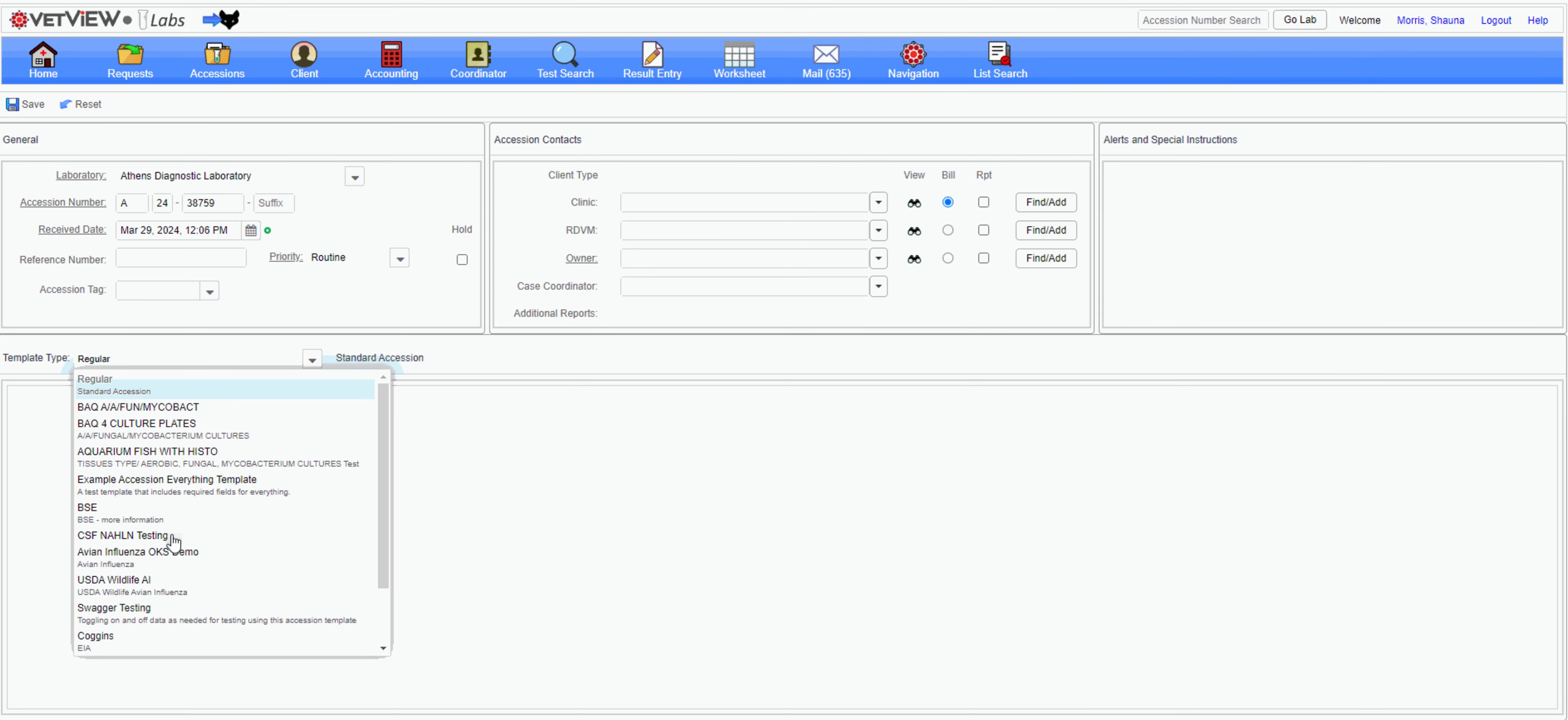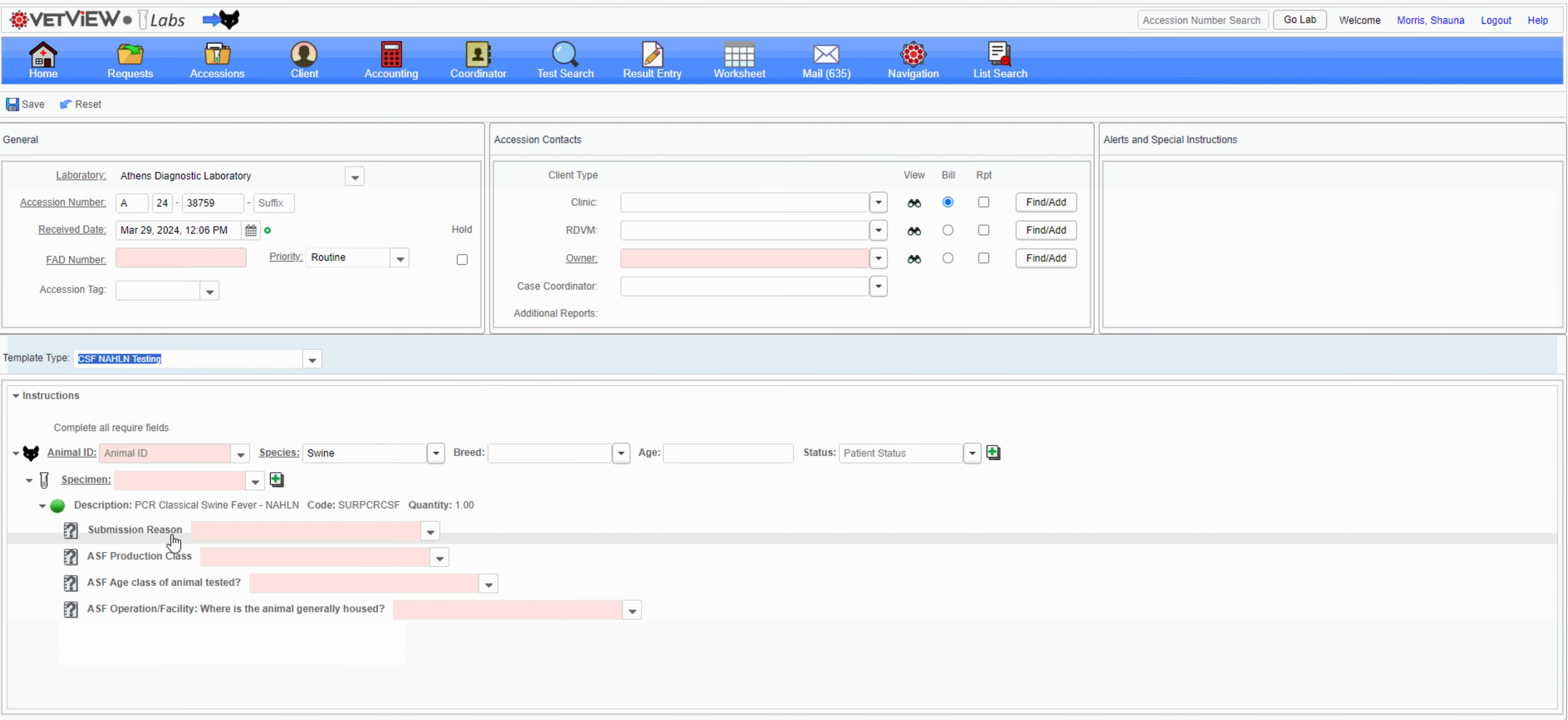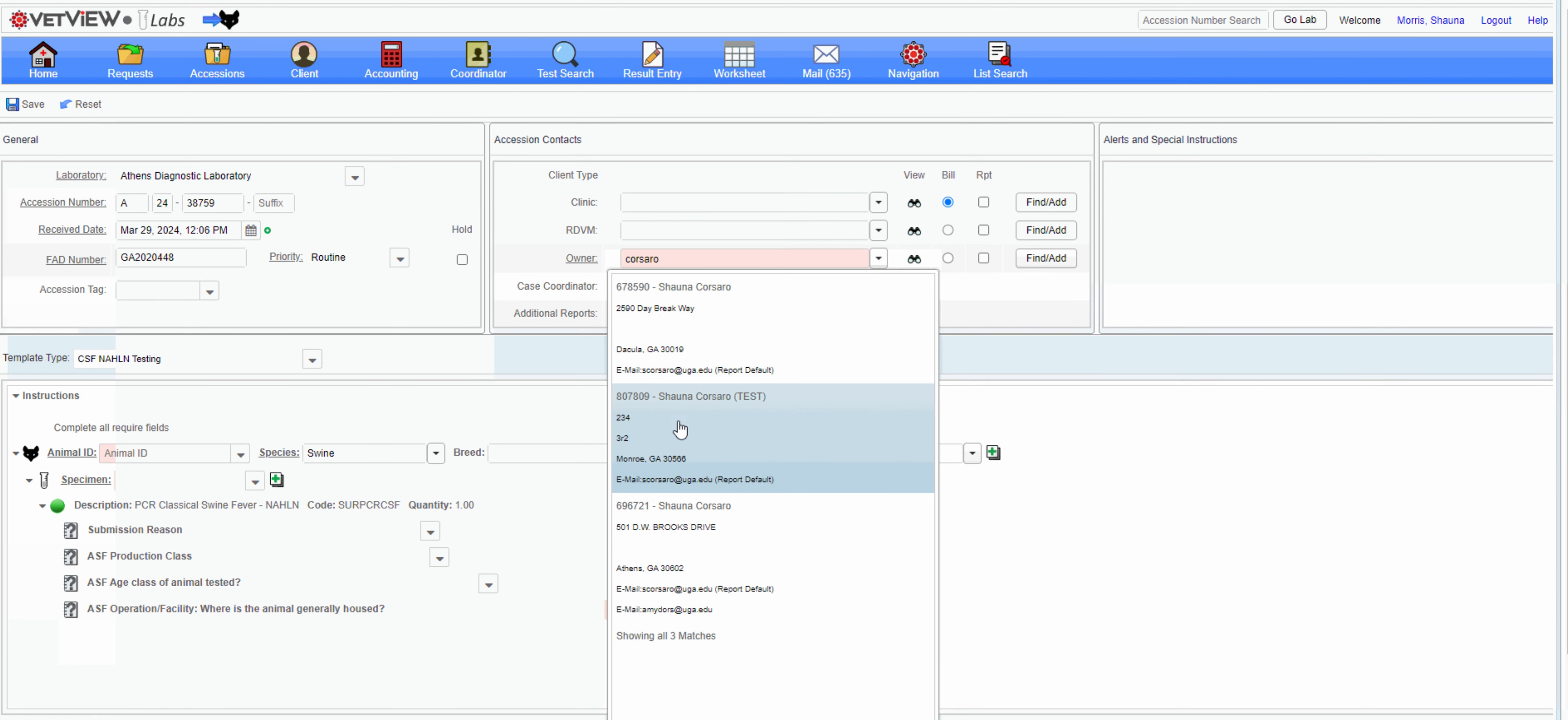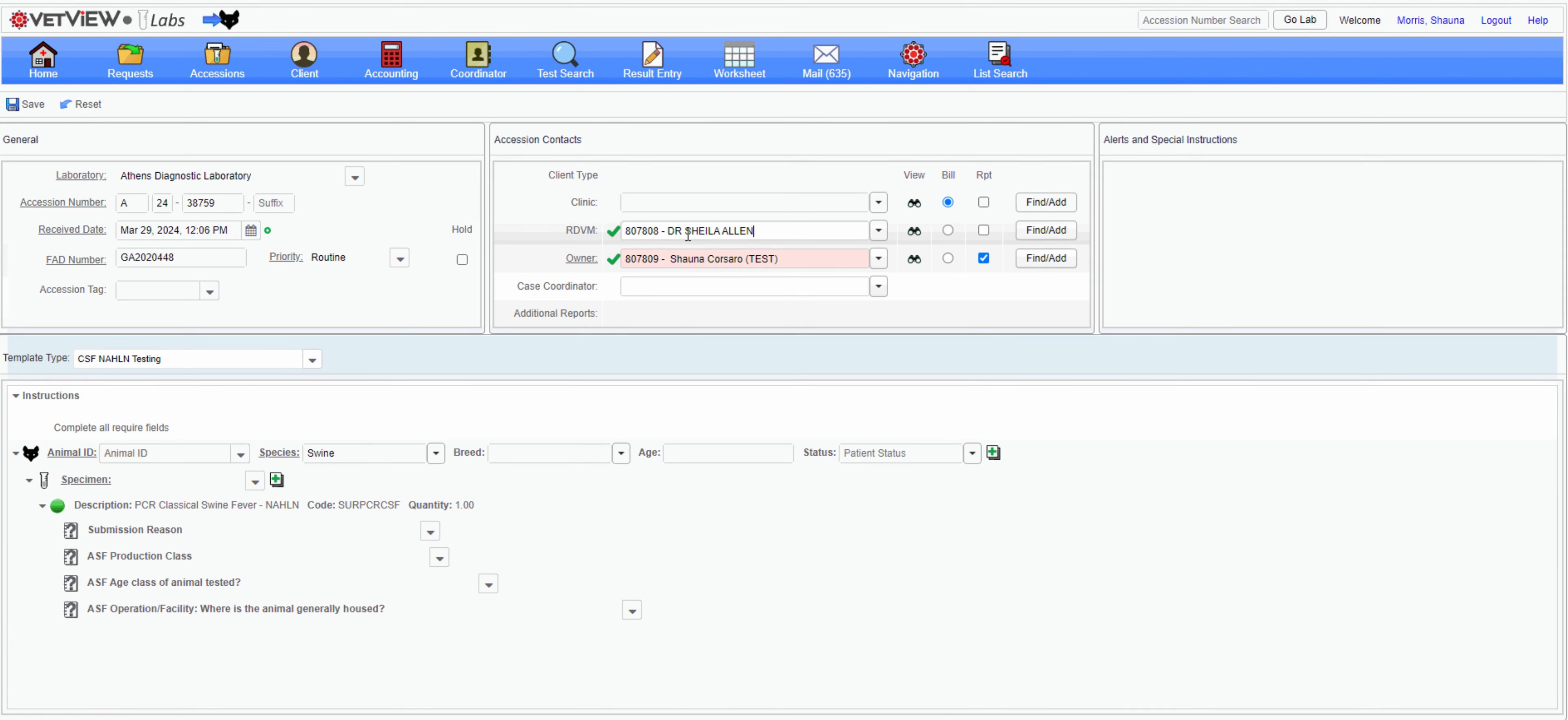When creating a new accession, simply select the template from the drop-down list. The accession fields will automatically update. Required fields are highlighted in red. This will help guide the user through the data entry process and ensure all fields are completed appropriately.